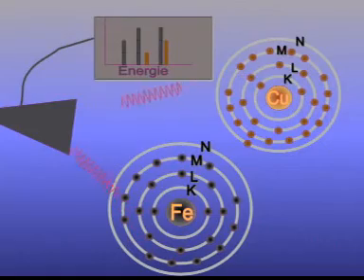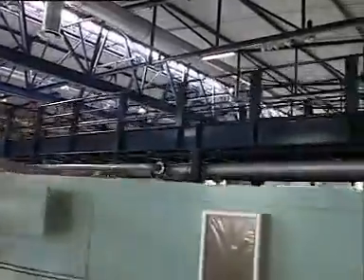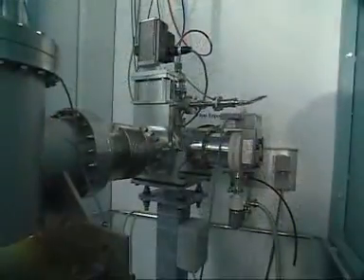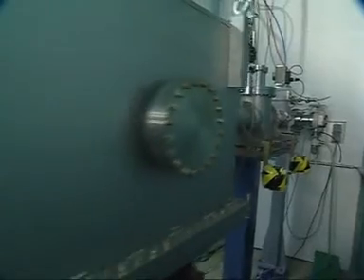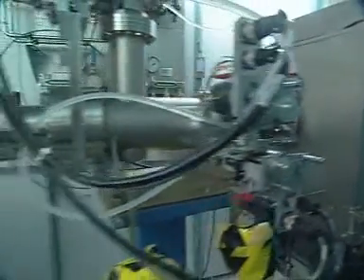For X-ray fluorescence measurements in ANKA, the synchrotron radiation is modified in various components on its way to the sample. Absorbers are used to modify the spectrum of the excitation radiation. The desired wavelength range is selected by a monochromator. Diaphragm systems are used to mask undesired edge zones of the primary synchrotron beam.